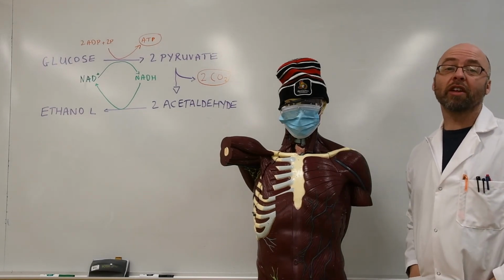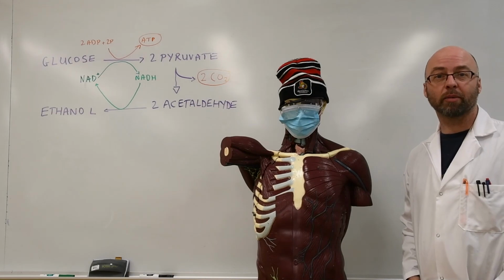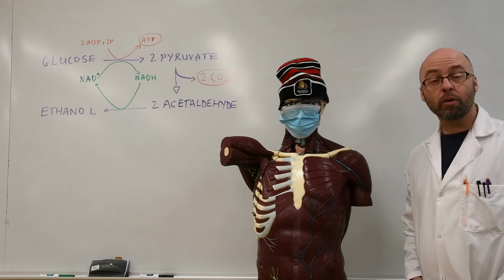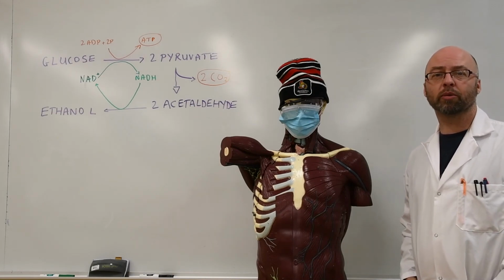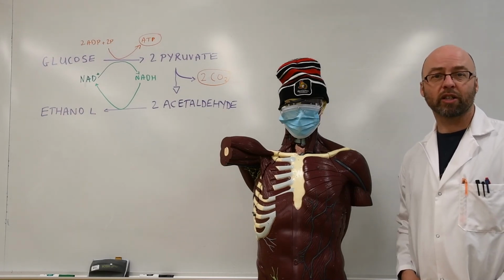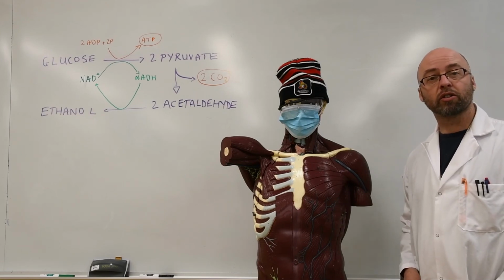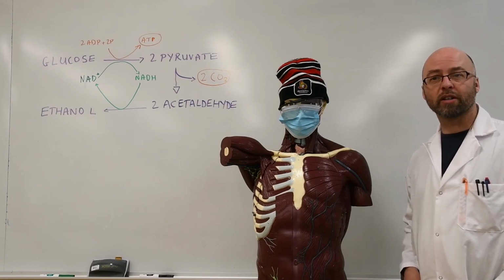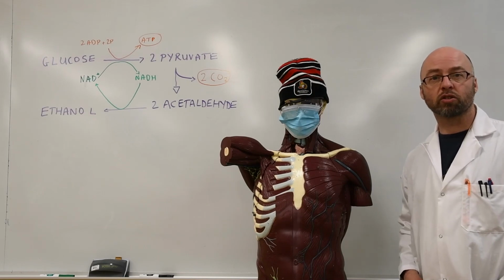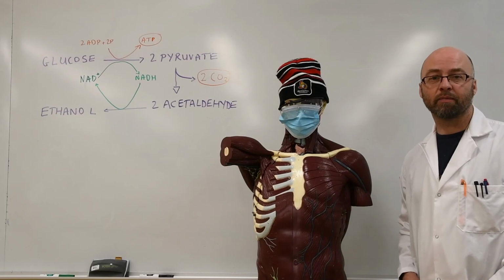Anyway, so that's the end of lab 3 on the alcoholic fermentation of yeast. Now you can go to Moodle, where you'll be able to access the raw data that I collected during the experiment, and you'll be able to create a graph so that you can submit that to the Moodle quiz, and also answer questions all about the experimental procedure and some of the data.